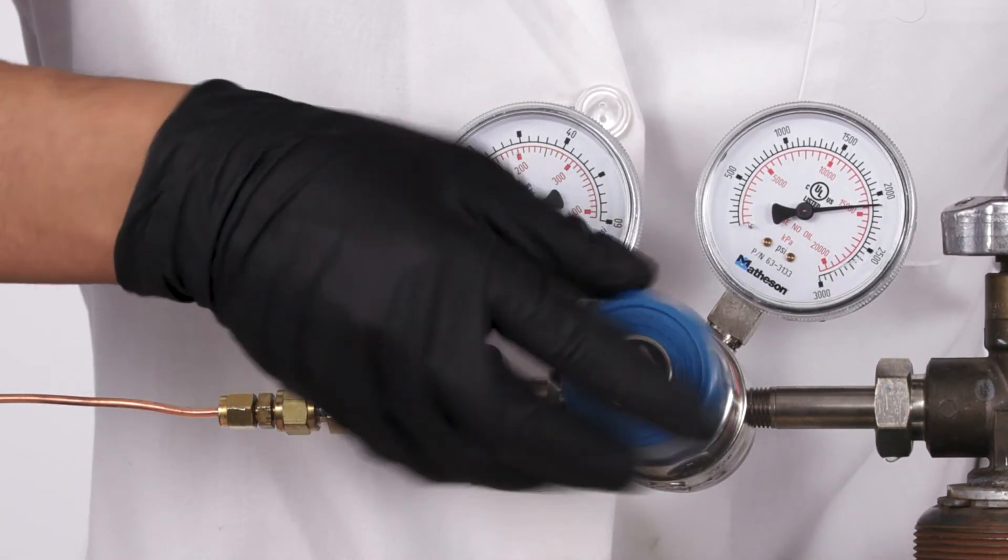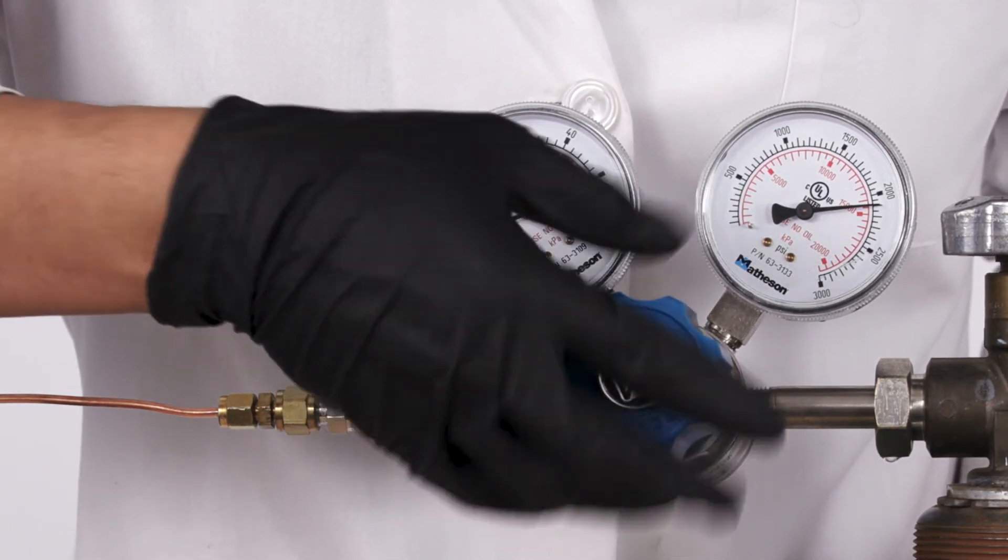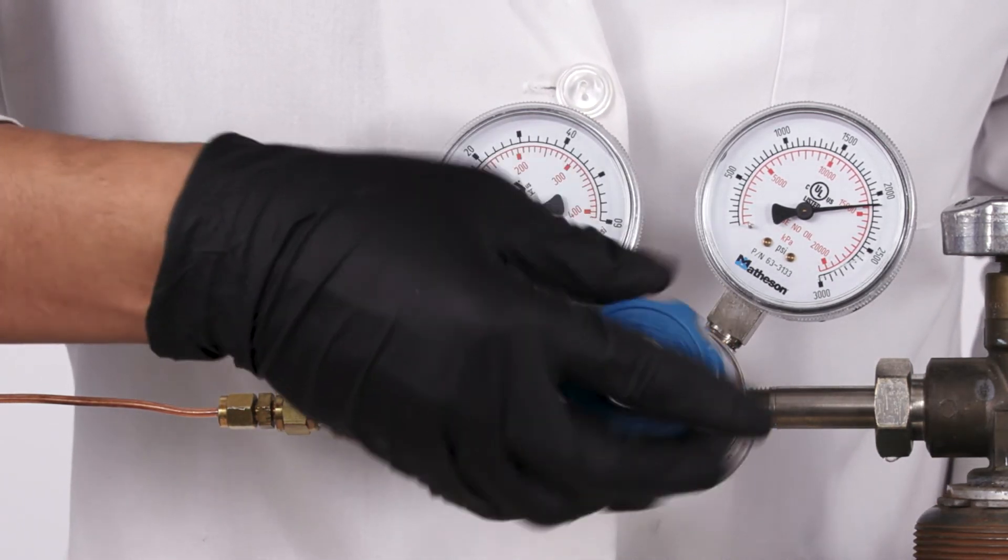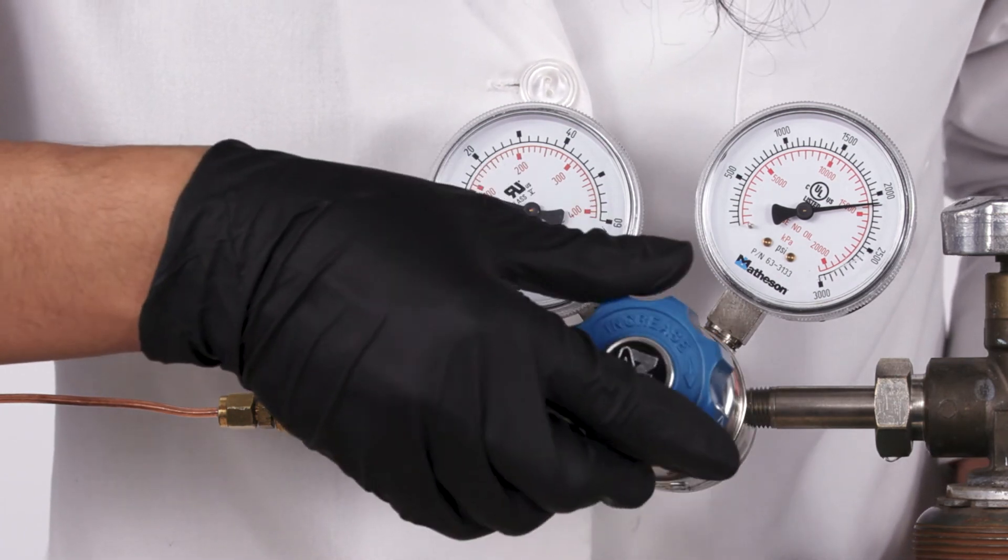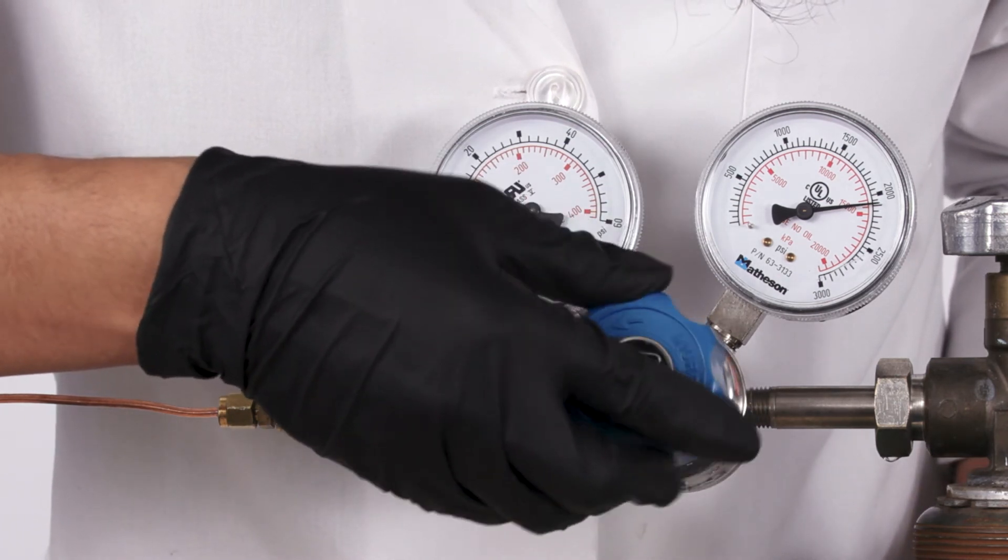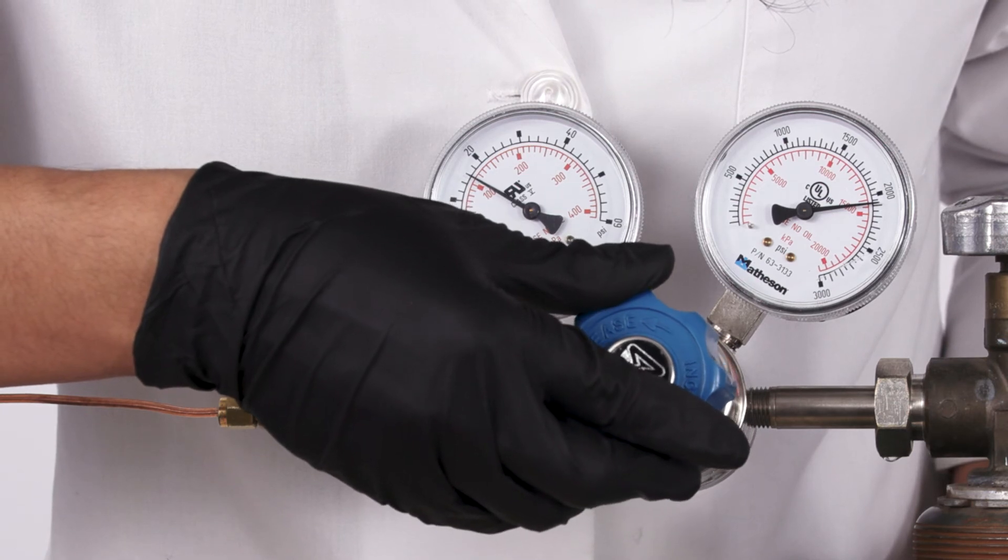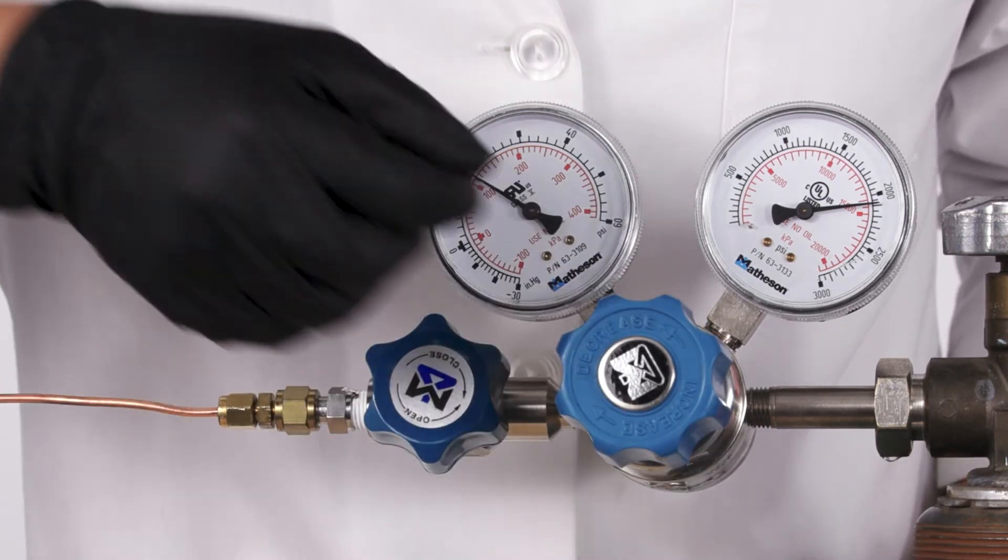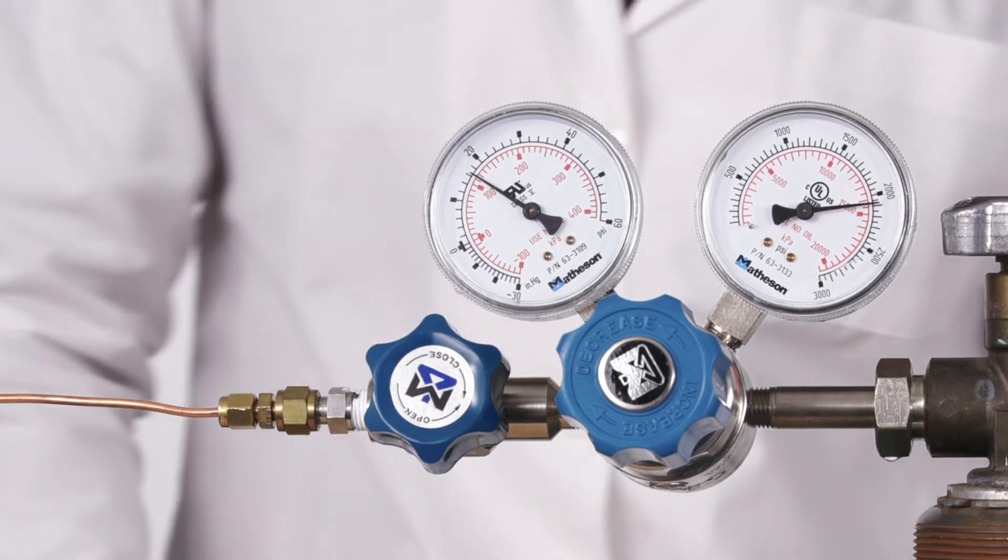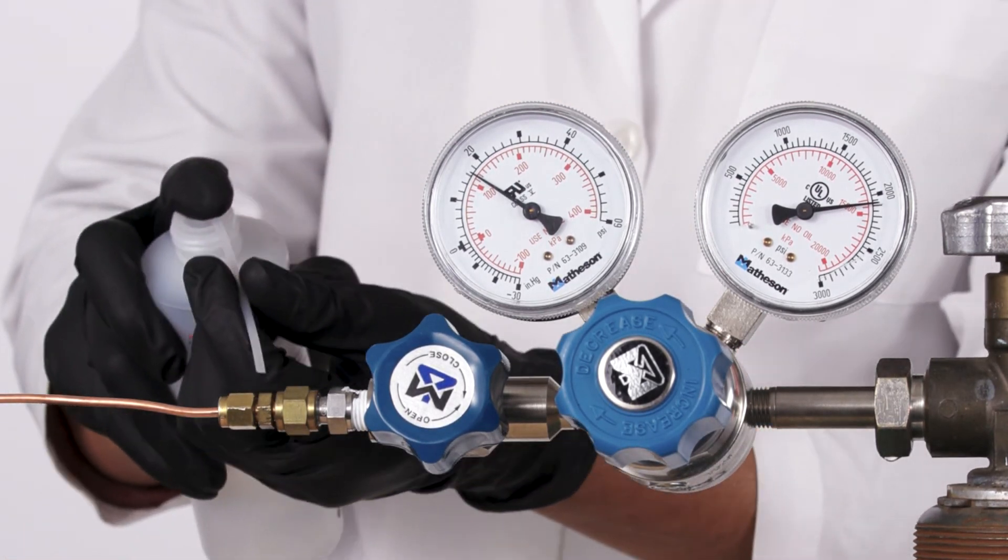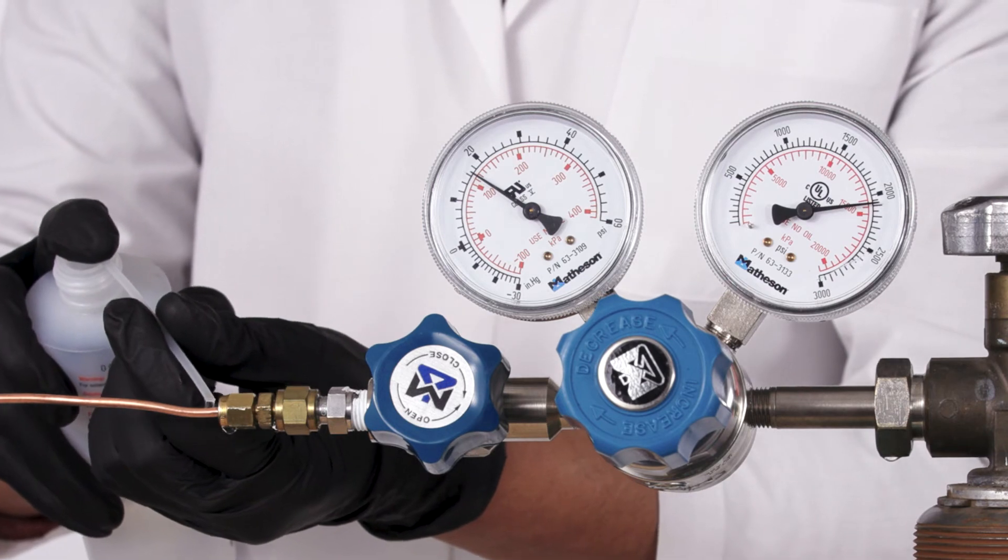Set the regulator to 14 to 15 PSIG by slowly opening the regulator control knob until the low-pressure gauge reads 15 PSIG. The isolation valve and regulator shutoff valve should still be open. Then, check the remaining gas line for leaks.